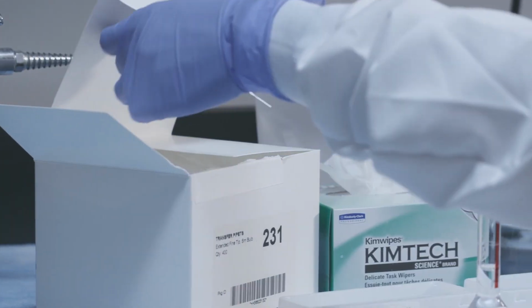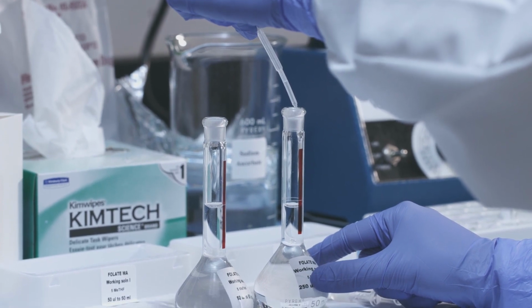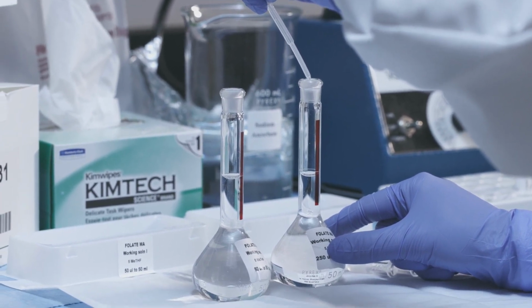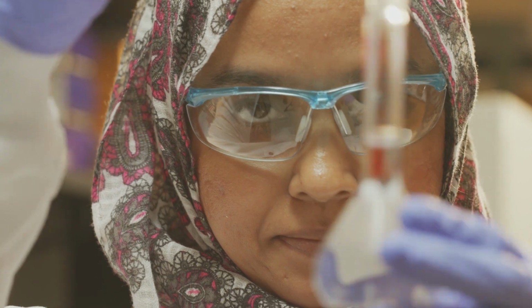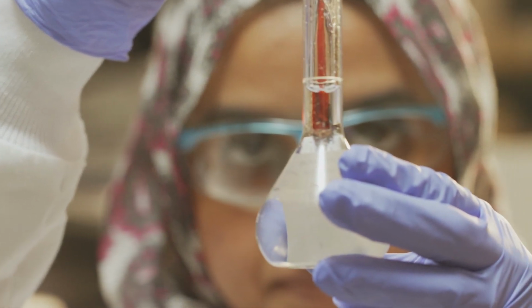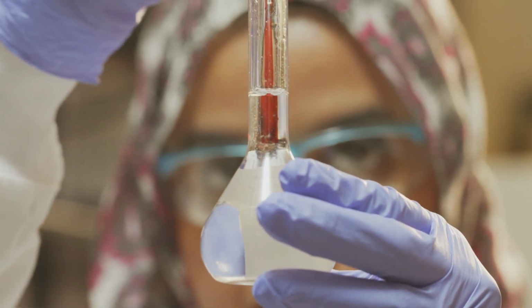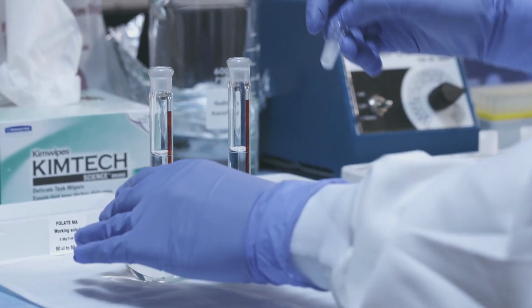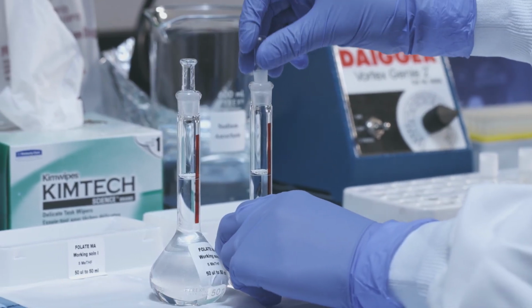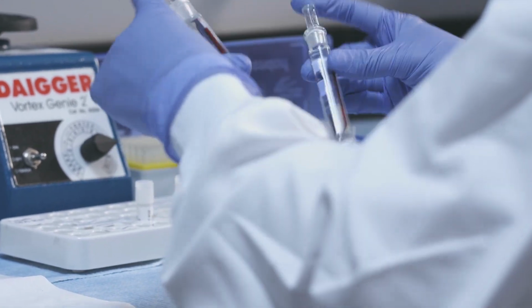Using a plastic transfer pipette that has a fine tip, make up with sodium ascorbate to the 50 milliliter volume mark. Be sure that the bottom of the fluid meniscus touches the calibration line of the volumetric flask at eye level. This is a very critical step to achieve accurate results. Slowly invert the volumetric flasks 20 times to thoroughly mix the calibrator working solutions.